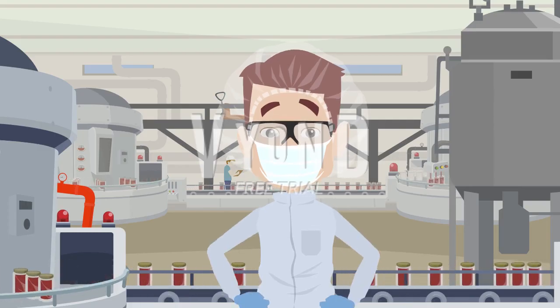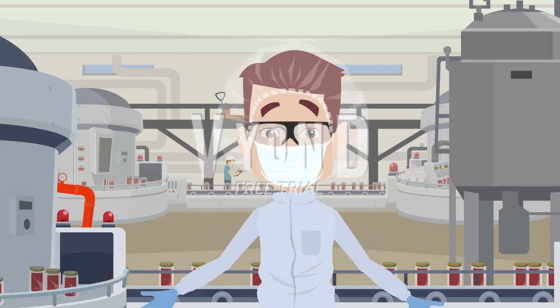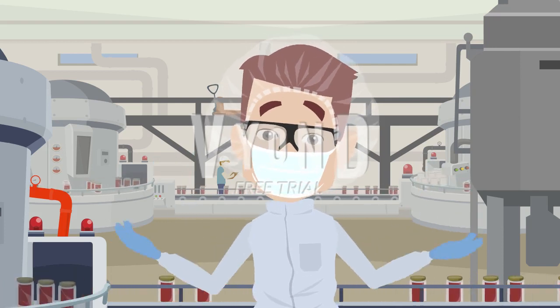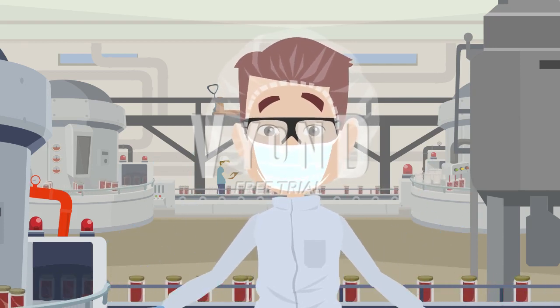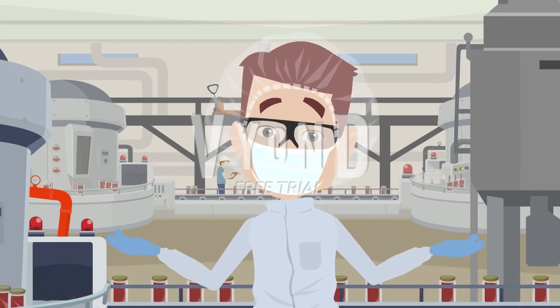Sterility testing is essential to ensure the absence of microorganisms in drug products. Two common methods are direct inoculation and membrane filtration. The use of such rigorously validated and appropriate methods is necessary for performing the sterility test.